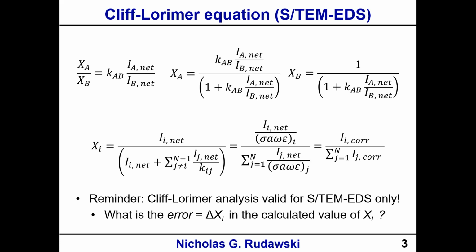So we have these fairly simple equations for the atomic fractions. What we want to know is what is the error, so the delta in the calculated values here. And that's what we're going to get into today.